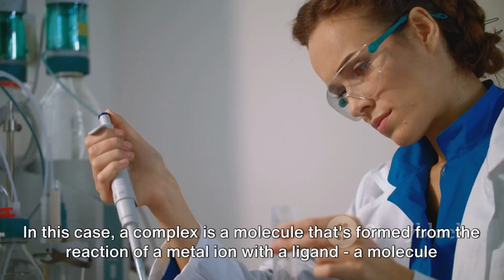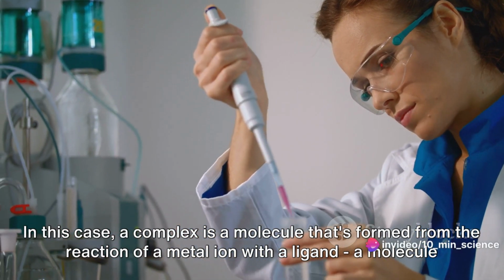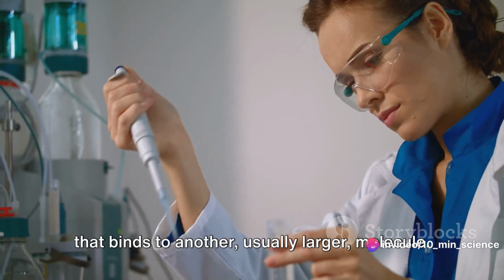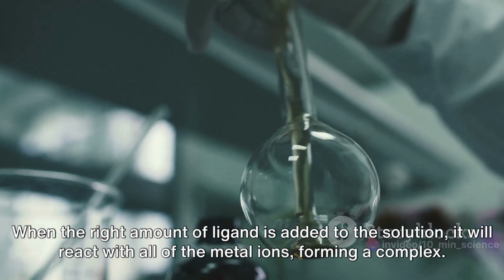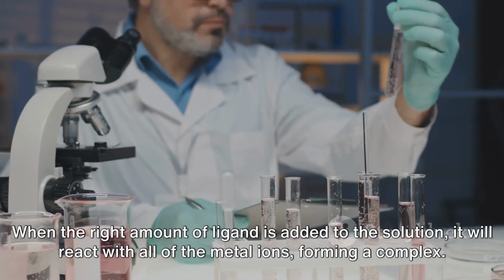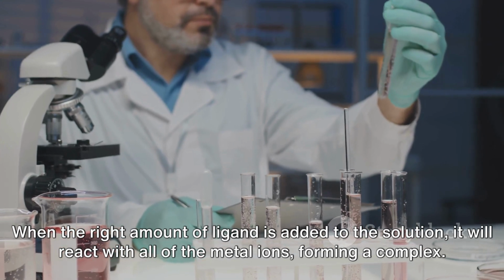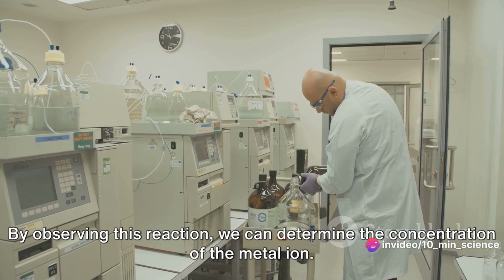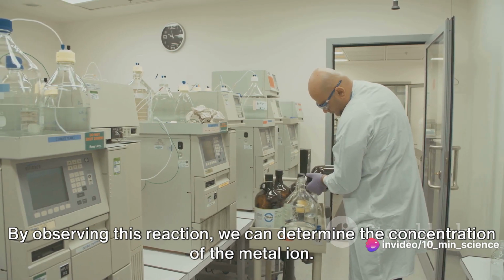In this case, a complex is a molecule that's formed from the reaction of a metal ion with a ligand, a molecule that binds to another, usually larger molecule. When the right amount of ligand is added to the solution, it will react with all of the metal ions, forming a complex. By observing this reaction, we can determine the concentration of the metal ion.